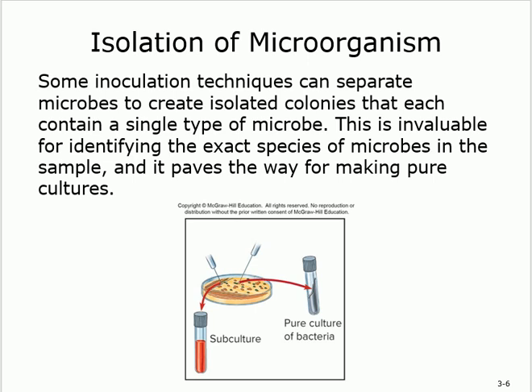However, with the newer techniques, from the beginning, at inoculation, you can inoculate different organisms in different spots. So you can put one organism here. Now you don't need the isolation. You are putting one type of organism. I got this Staphylococcus epidermidis, I put it in that medium to grow, and that's it. So you don't really need isolation. This is excellent if we can do it.